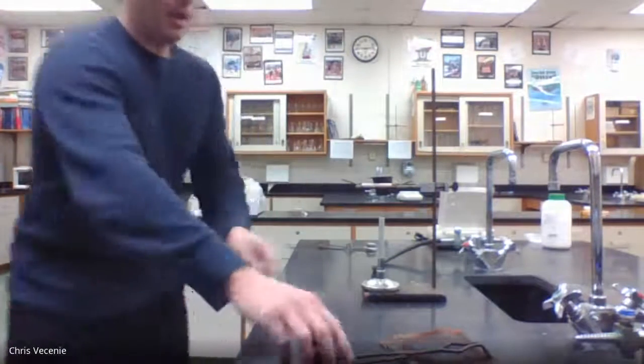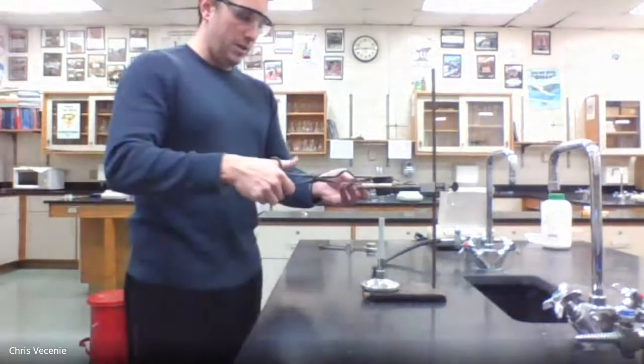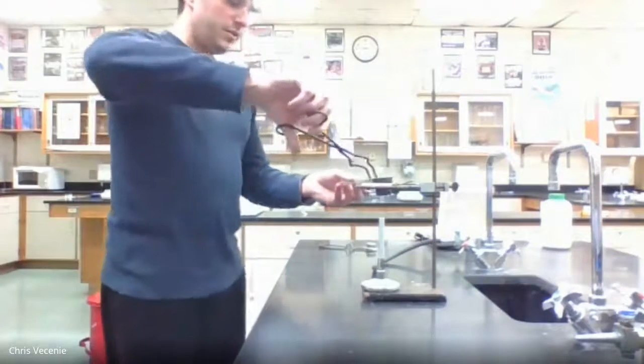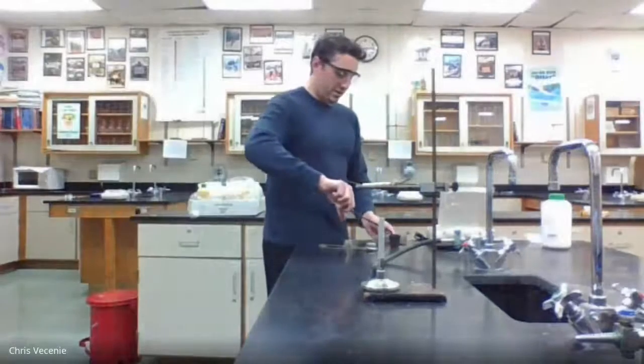All right, so I'm going to go ahead and get my original mass here. Right, and remember, this would be incredibly hot. So I'm going to take this guy, put them here, reach down in here, grab this, move these over as a unit. All right.